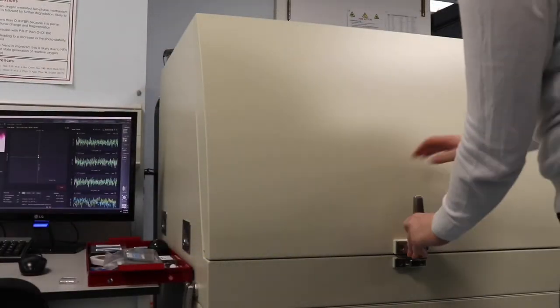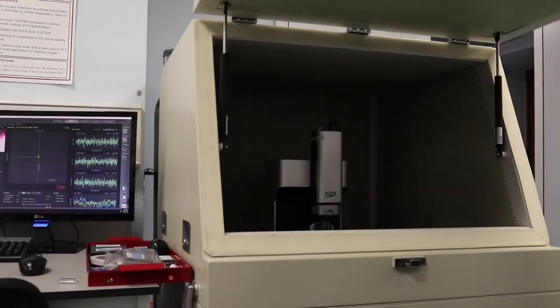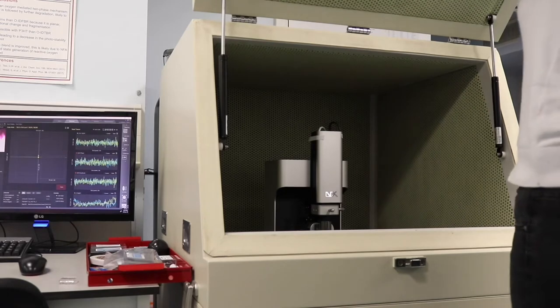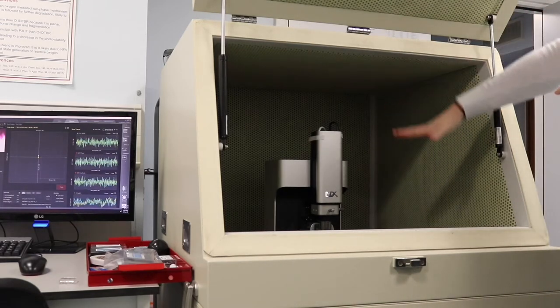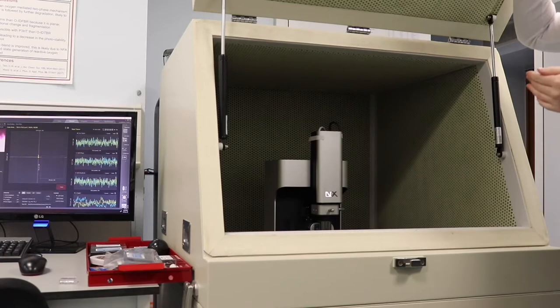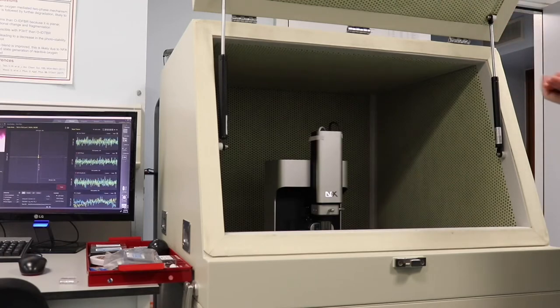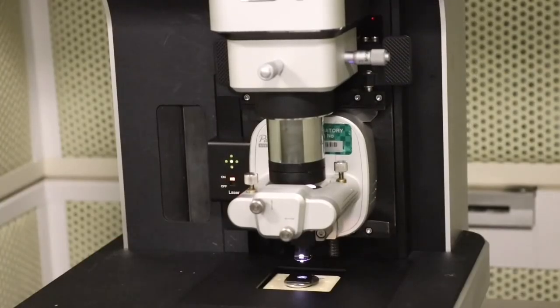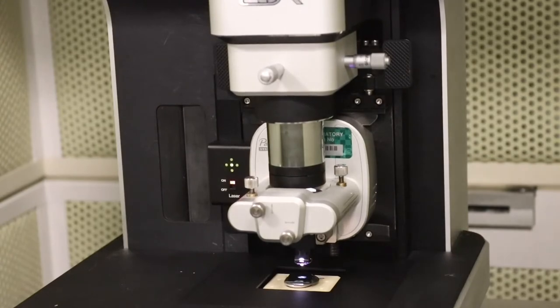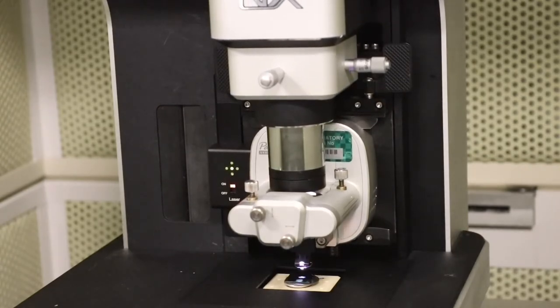This is the AFM which is atomic force microscopy. We use this to measure the topography of our samples. The sample is put in here and we lower down a very fine tip onto the surface of the sample. This measures the surface giving us really beautiful images of topography which can really help us understand the morphology of our samples.